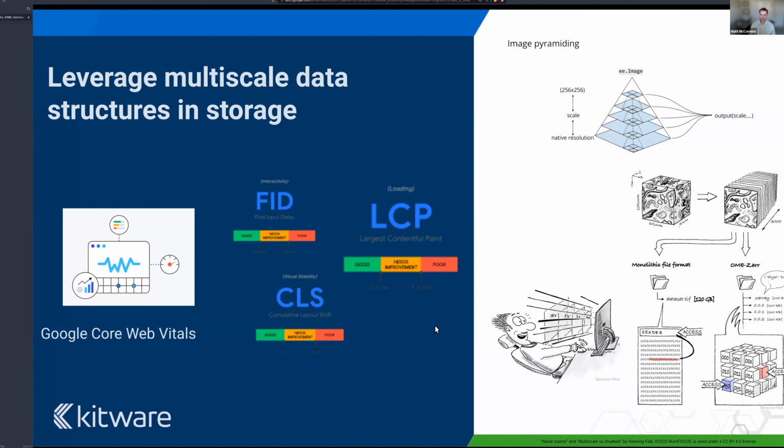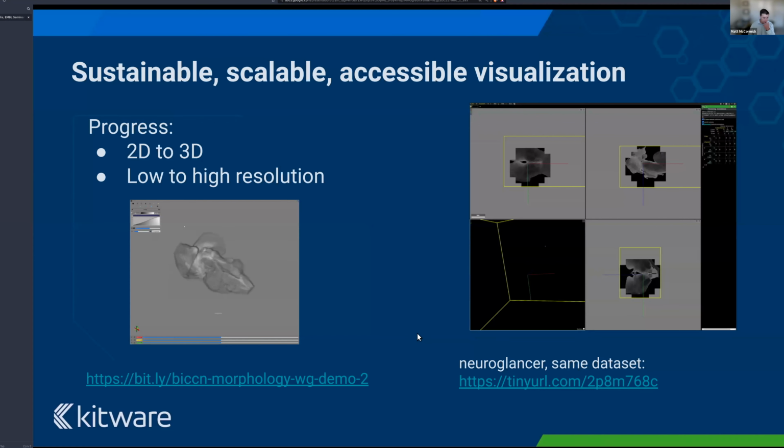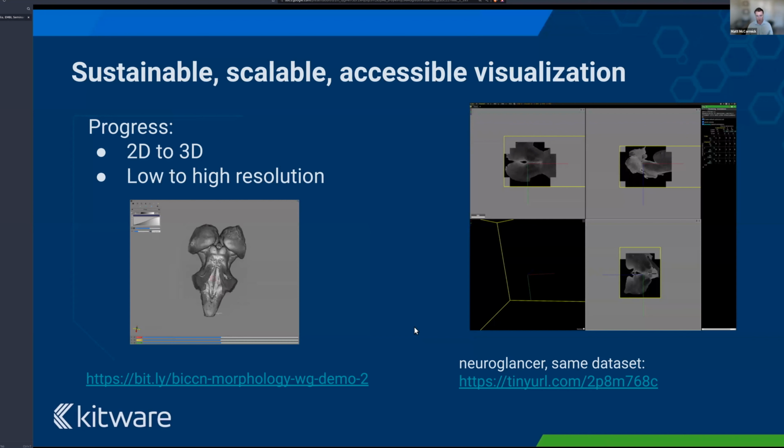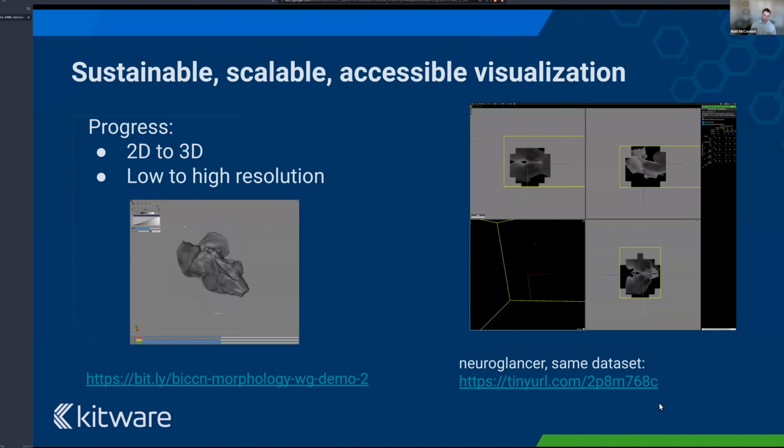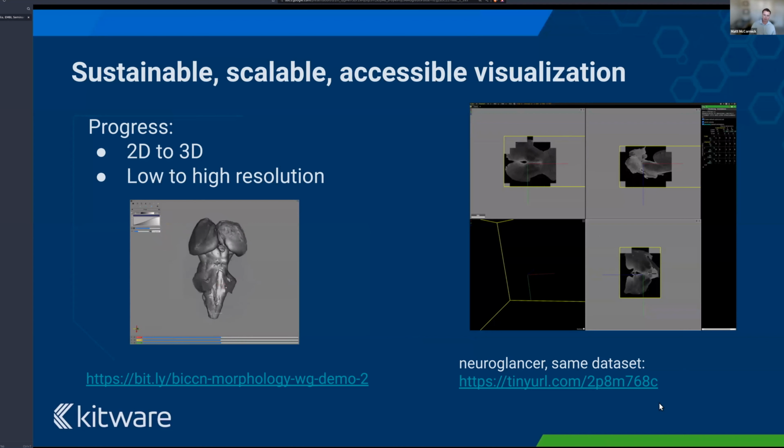In the business world, those are metrics on how much value your application is having. And in the scientific world, this is enabling us to get as much knowledge as we can out of the data, in a similar way. We can do that with tools that progressively load the data, if we're visualizing it, from 2D to 3D. Neuroglancer, I think, is one tool that comes to mind, especially taking us from this tiled loading experience of MapQuest or Google Maps, but with scientific microscopy data sets.